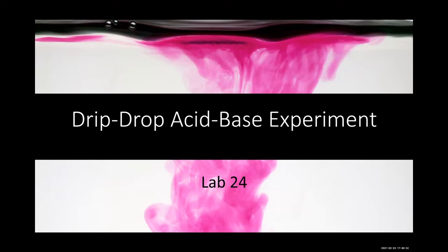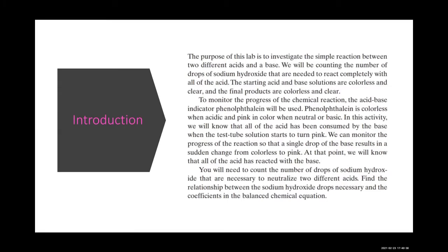Drip Drop Acid-Base Experiment, Lab 24. Introduction. The purpose of this lab is to investigate the simple reaction between two different acids and a base.